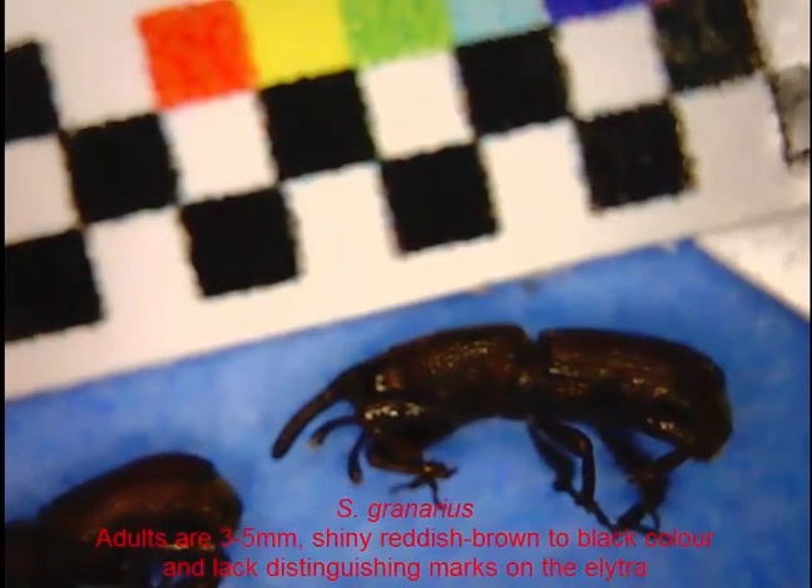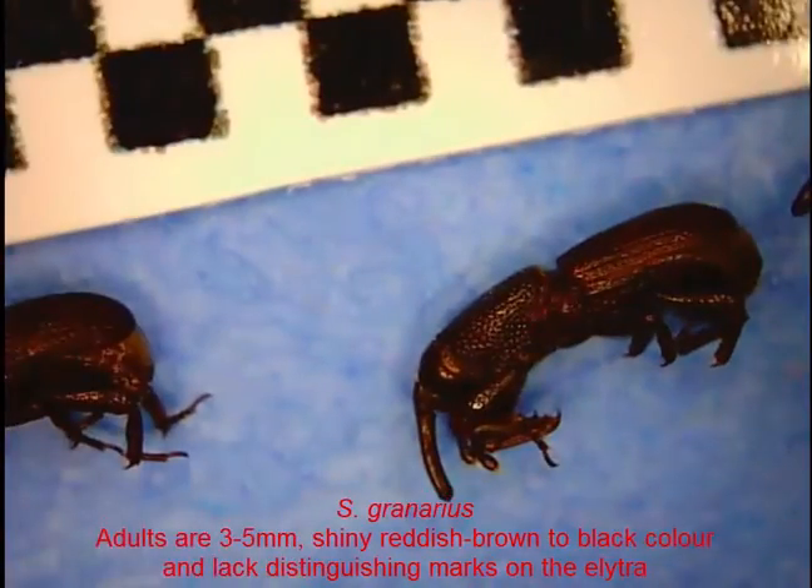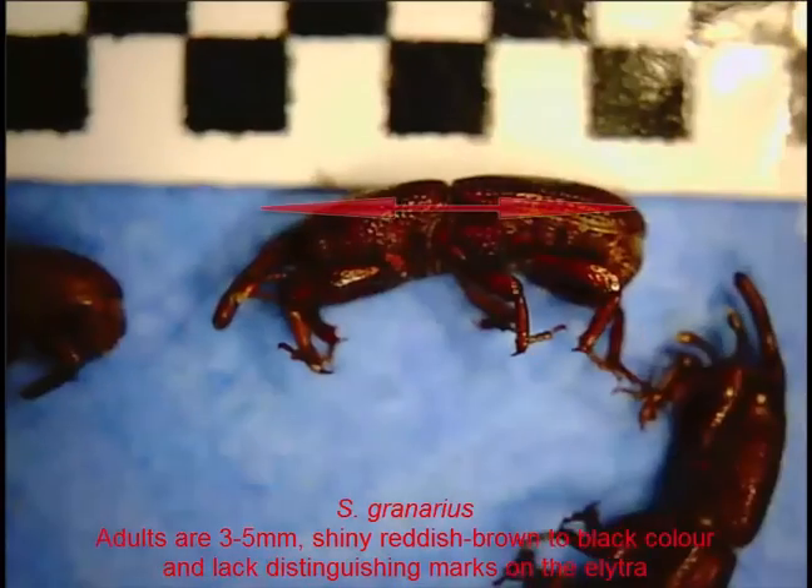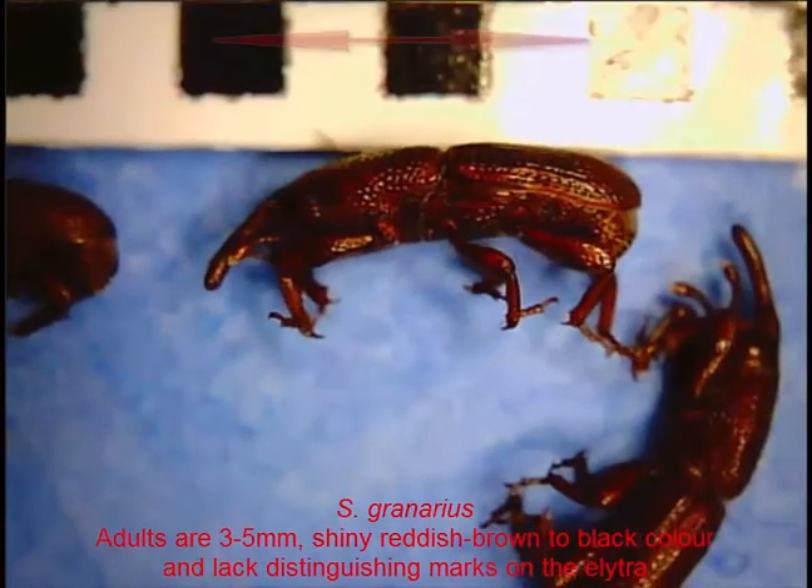The first specimen I'll look at is Sitophilus granarius. It's a reddish-brown colour and they're usually three to five millimetres long. These ones here I can measure out on the screen at around about 3.7 millimetres.